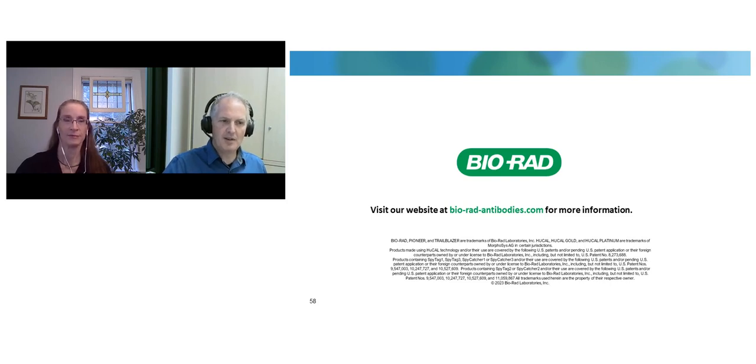And if we clone these 10 to the 17 cassettes into our library to get 10 to the 11 colonies, then it's just extremely unlikely to get one antibody twice. It's like winning the lottery, literally. And of course, we have diversity in the other CDRs as well, which decreases the chance of finding an antibody twice.